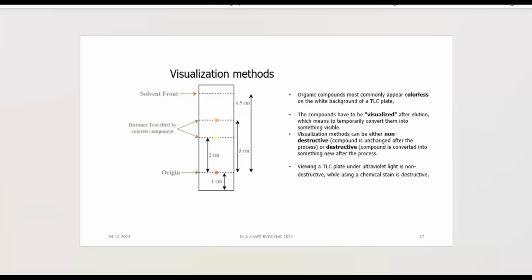In general, there is going to be a competition between the mobile phase and the stationary phase for the analyte. The analyte will keep interacting with the functional groups on the mobile phase and those on the stationary phase, and depending upon the strength of interaction, if it is a strong interaction, it will be held in that particular environment.